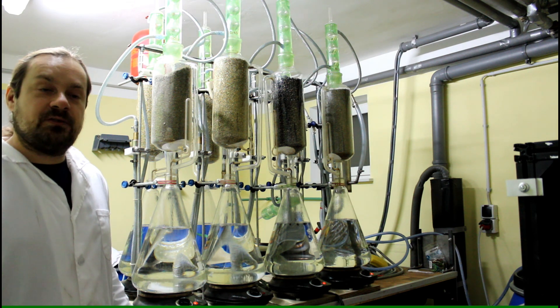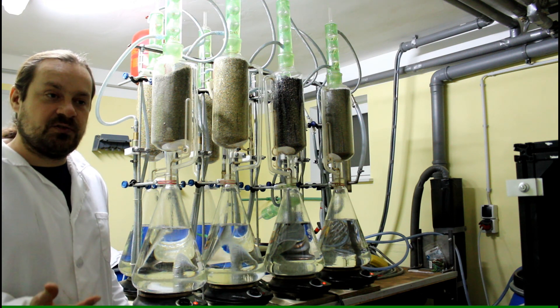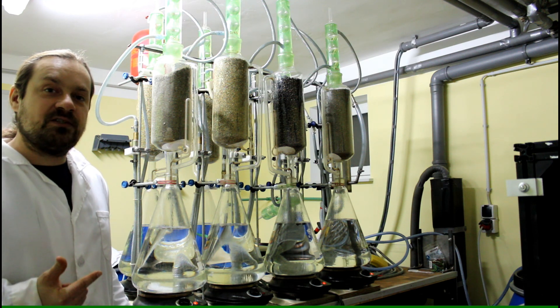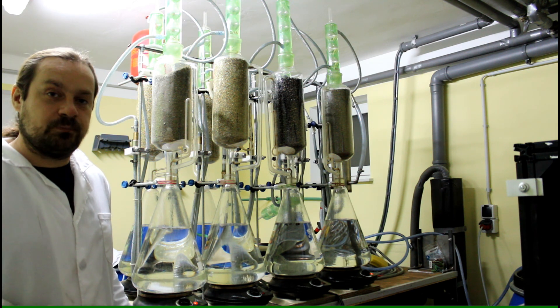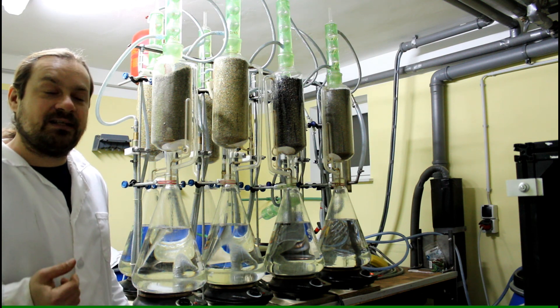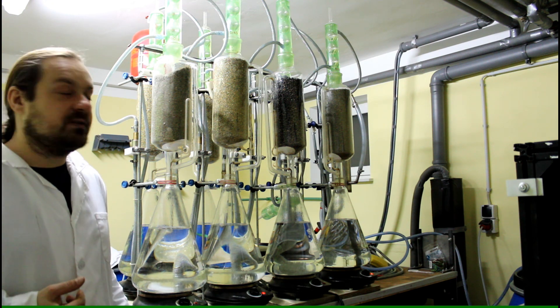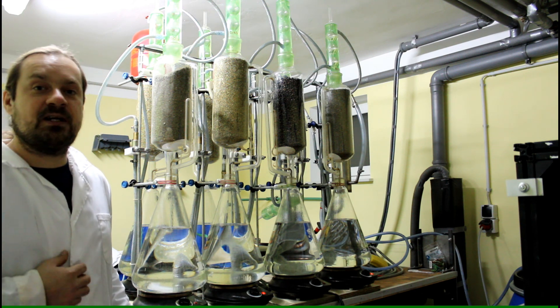There are ways to work around the issues of energy consumption and high boiling temperature: running the Soxhlet apparatus under vacuum or partial vacuum. I have built a device for this and will make a future video about exactly that. I hope this shed some light on the advantages and disadvantages between these two extraction types.